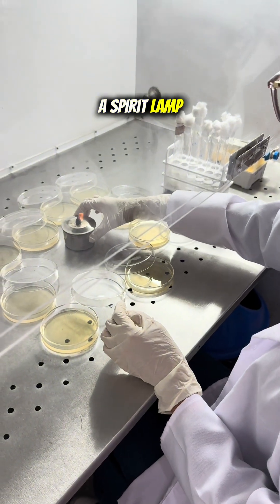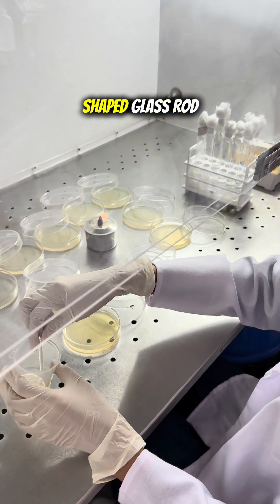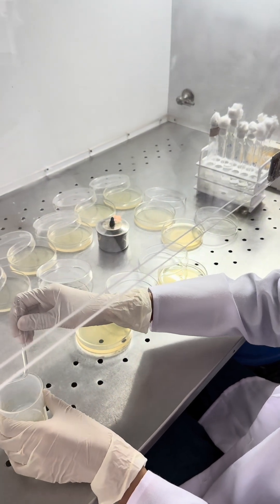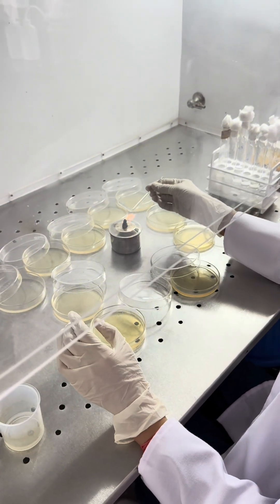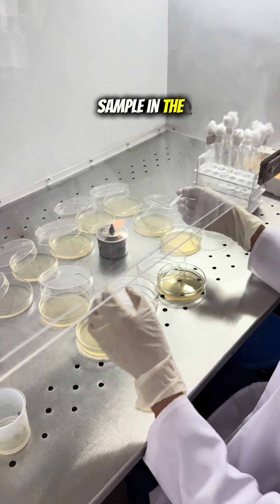We have a spirit lamp, which we will use to sterilize our L-shaped glass rod. We will then use this glass rod to spread our sample across the plate.